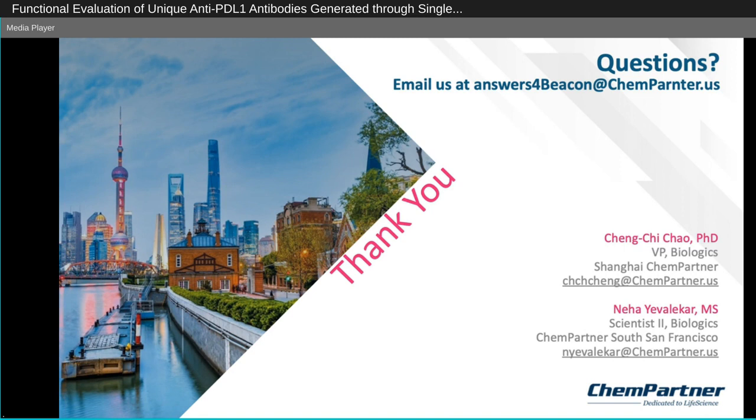We have certainly tested a couple of different configurations that have worked on a number of projects we have done in the past. We have also done the in-pen binding and blocking assay, which seems to be very popular, certainly because you can identify potential candidates with blocking activity early on. Recently our projects have also focused on reporter assays, where we were able to identify certain clones which activate the pathway, seen in the form of a GFP signal over a certain time. Those kinds of assays can also be done on the Beacon platform.